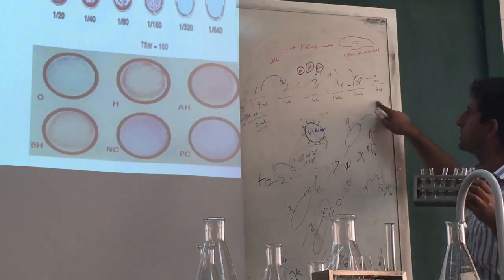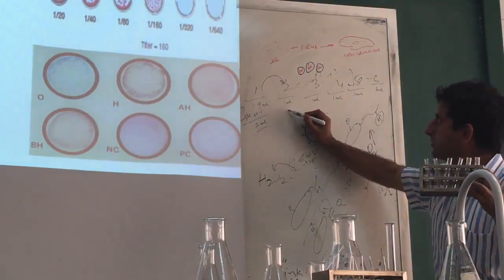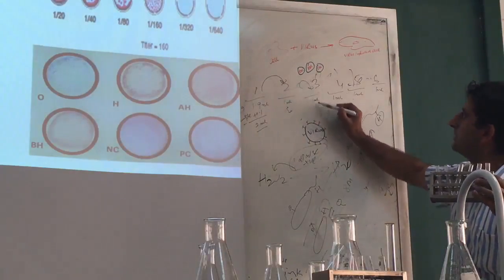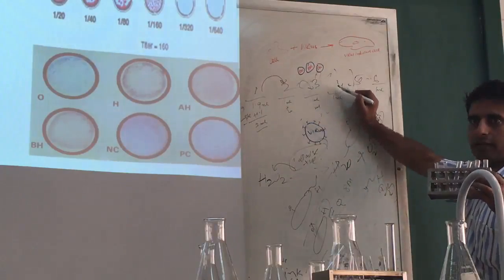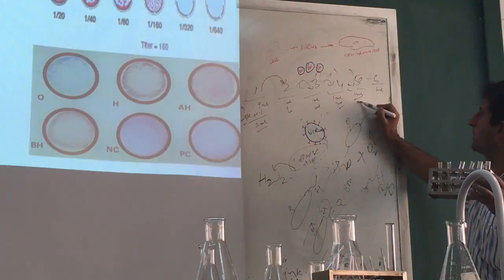Here you will do nothing. It is just 1 ml. But from here, you will put 1 ml, give it to him. How much does it become now? It will become 2 ml plus 1 ml from this. But again, you will remove from here 1 ml and put it here. It will remain again 1, it becomes 2. Again, you will give it to here. It became 2 ml, but when you remain, it became 2 ml.